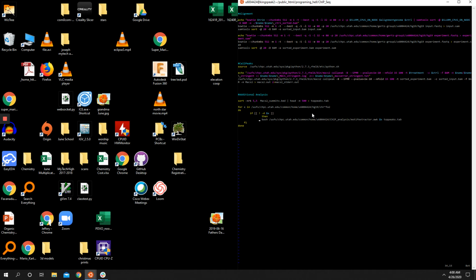So I'm going to teach you a little trick here. When you're running things on bash, it will run the command you have and it'll stop you from typing any input until that command is done. But in reality, computers run a lot faster than humans, so it can do multiple jobs at a time, and bash can farm jobs out to multiple cores. So when you're using the command line, you're typically only using one core at a time, and we've got at least 20 cores, and we've got 22 chromosomes.